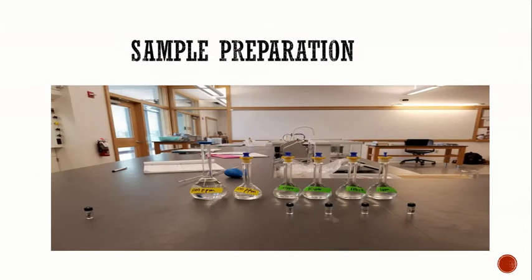So these are our standards, and the small vials you see there are what goes into the injection portion of the HPLC machine. So we put some amount of our prepared standards in the small vials and then put them in the injection area of the machine to be tested.